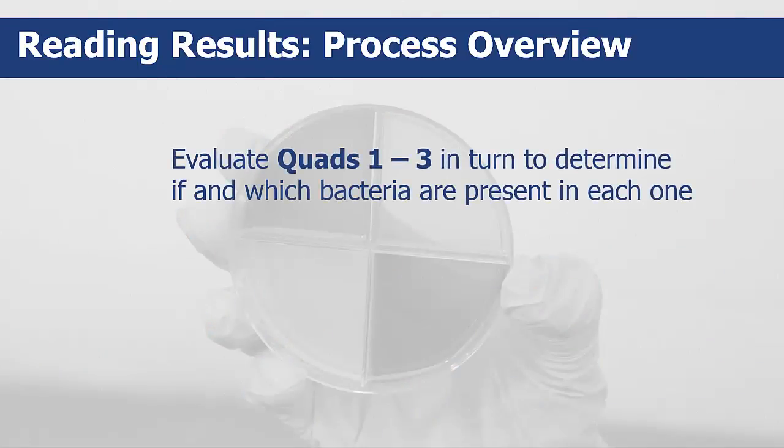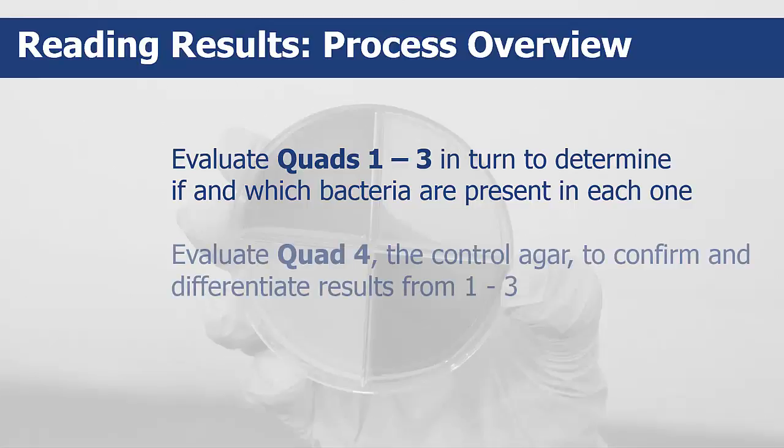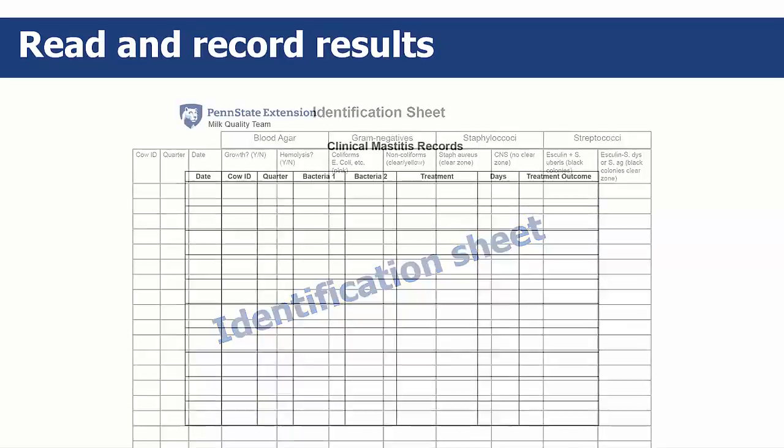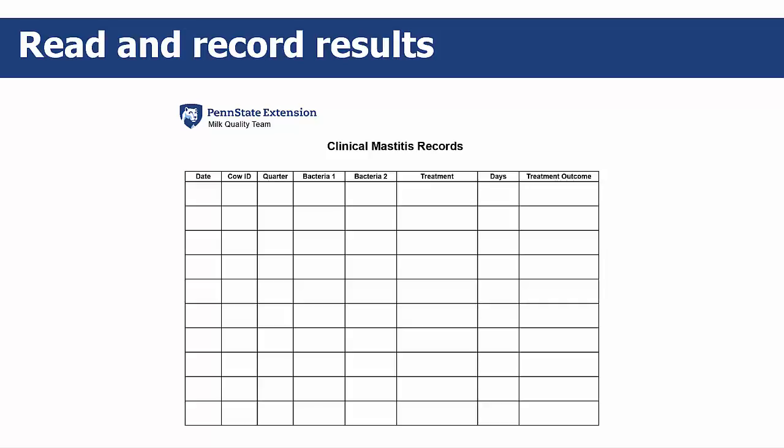You'll evaluate quads 1 through 3 in turn to determine if and which bacteria are present in each one. Then you'll look at quad 4, the control agar, to confirm and further differentiate results from the other three. It's critical to carefully read the plates and growths and write down the results accurately. This is the identification sheet where you record the results from each quad, and this is the treatment sheet.